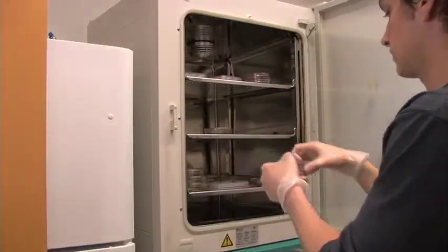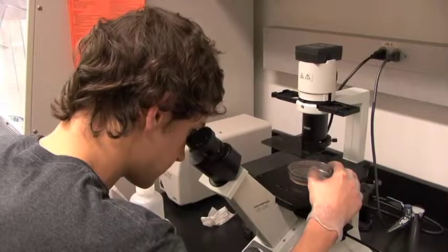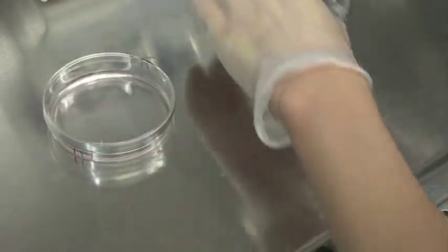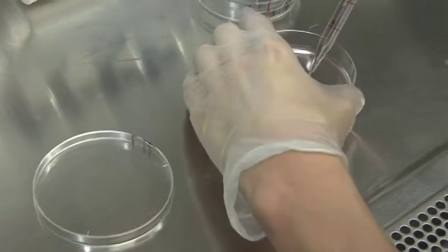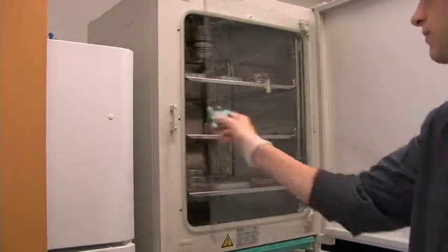The next day, the cells are analyzed under the microscope to make sure they are alive and healthy. The cells are then moved to a new plate with fresh media to select for only healthy cells. The cells are then incubated for 2 more days.